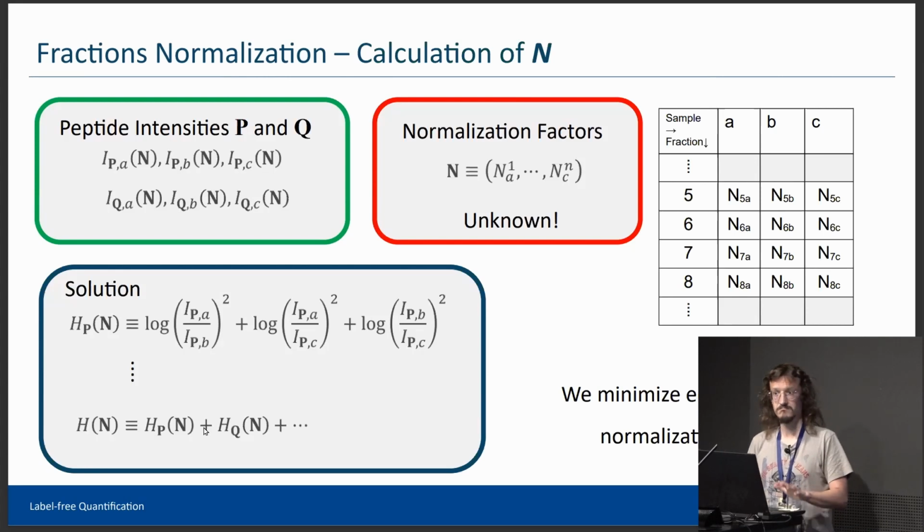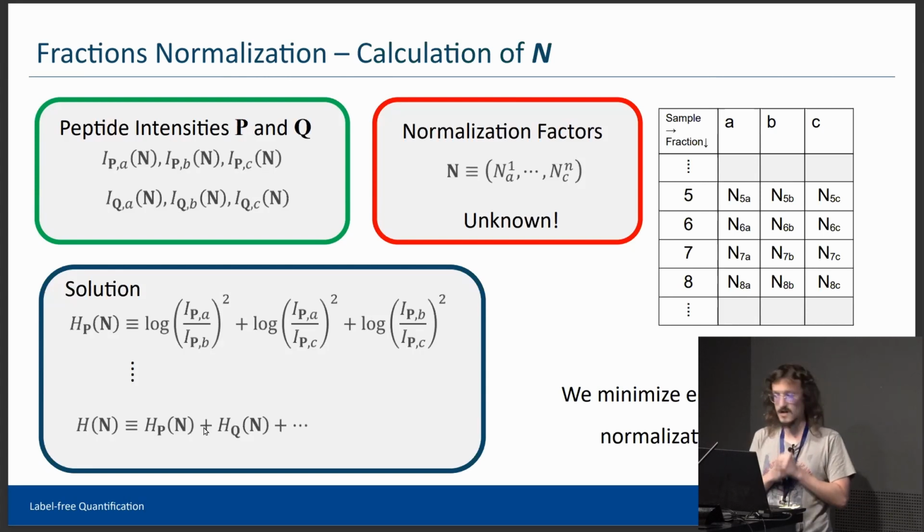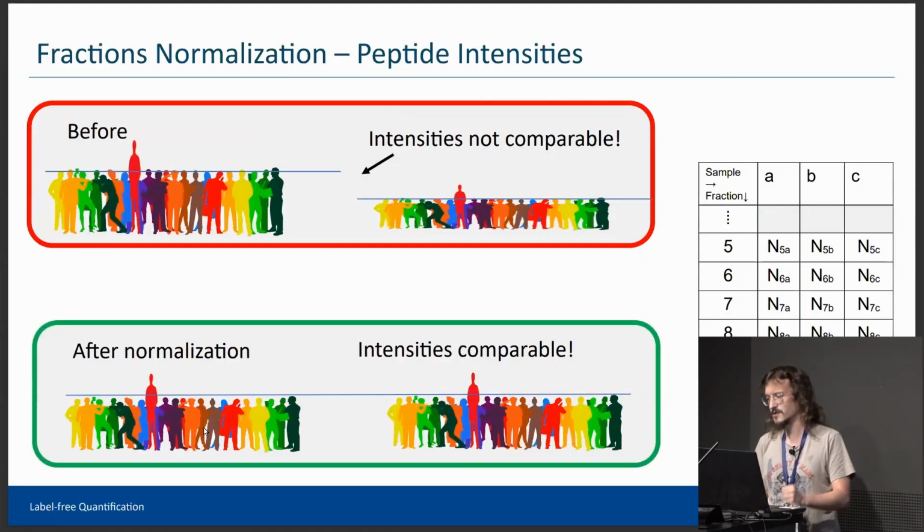Is it clear? Kind of. As you can imagine, this requires a lot of time to be calculated, especially if you have a very large data set. So there are ways to reduce the time that MaxLFQ requires to get your output, but we will see that further on in the presentation.